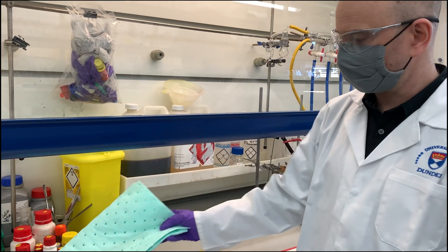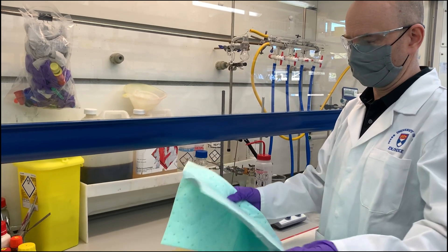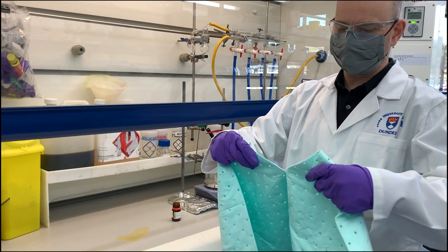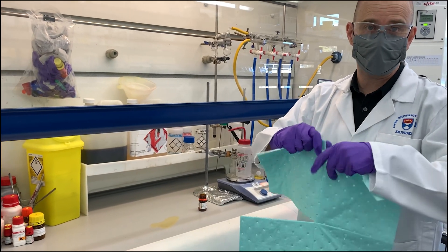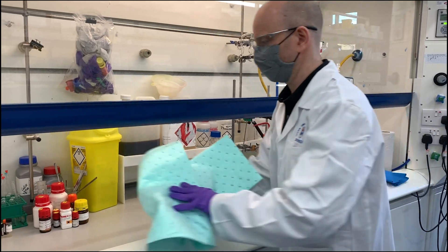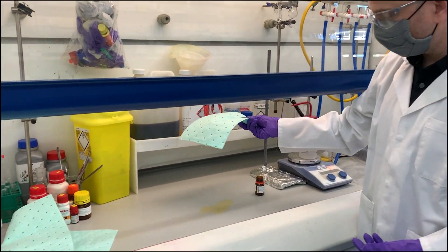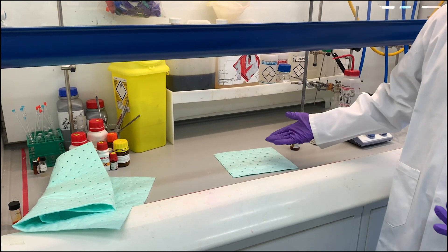What we would normally use for these kinds of spills is this absorbent matting. They come perforated so you can just tear it to the size that you need, and that can be applied directly to the spill. Then just allow that to soak in.